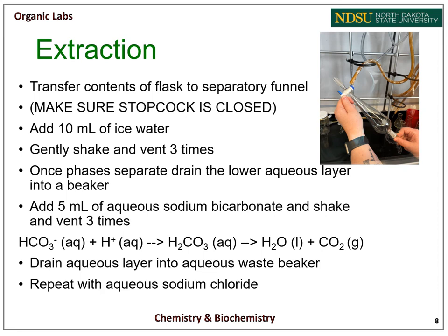Next, add 5 milliliters of aqueous sodium chloride to the separatory funnel. Shake and vent 3 times. Drain the aqueous layer into the aqueous waste beaker. The aqueous layer will be comprised of water.